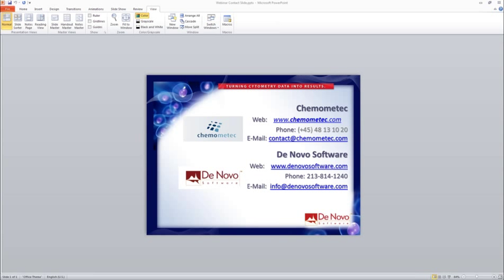No, I think it's very beautiful, everything, and that both you and we can do this gating from image to plots and from plot to image, and you have a very good way of treating multiple data samples, so the batch processing is really fantastic, and also the way of doing the analysis of the cell cycles, getting the G1, G2, and so on coefficients, and seeing whether there is aneuploidy and stuff like that. This is really a great supplement to the NucleoView software that controls the NC-3000. So I really think that the Novo software and the Chemometec software can work very nicely together on this, and we have very good cooperation. So I think this is covering very much everything.